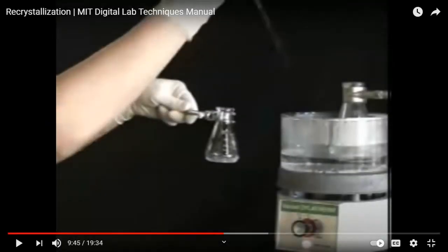You see what they did? That's why this is MIT maybe. She used the extra liquid I criticized, but they boiled it off. Okay? What's not so good? What if your compound is like a protein or DNA, very sensitive to the heat, and you're boiling it? Okay, it's like you caused the trouble and you are trying to solve it. It's better than not doing it, but the best is that you control not causing this problem.